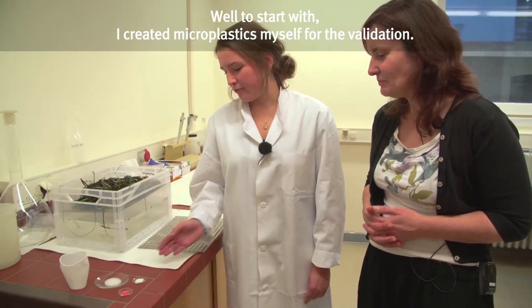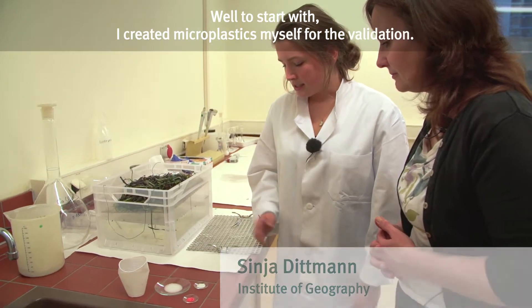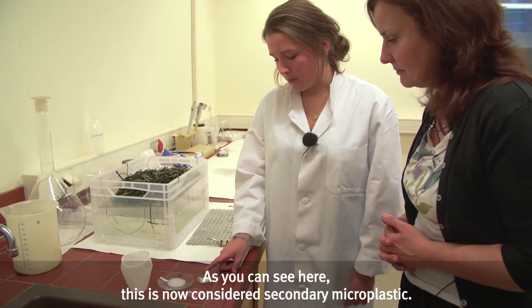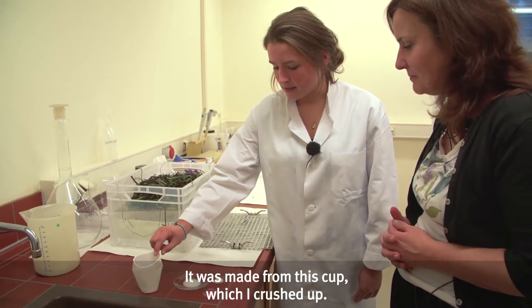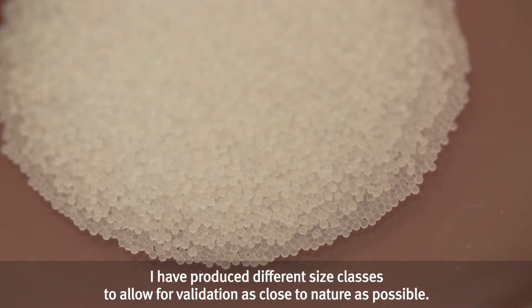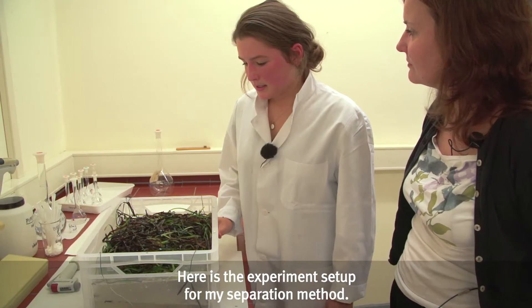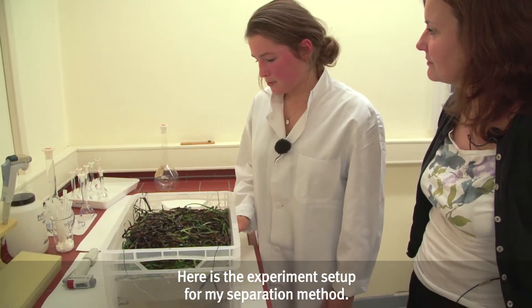I have first made microplastics for my validation. You can see here that it is a secondary microplastic — this microplastic is made out of this cup (Becher), which has been cleaned up. I have produced different size classes (Größenklassen) so that the validation can be carried out under natural conditions. And here is the experimental setup (Versuchsaufbau) for my separation method.